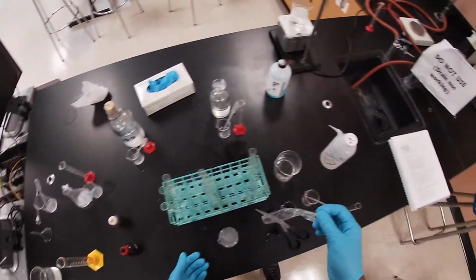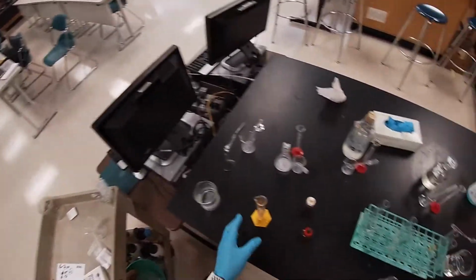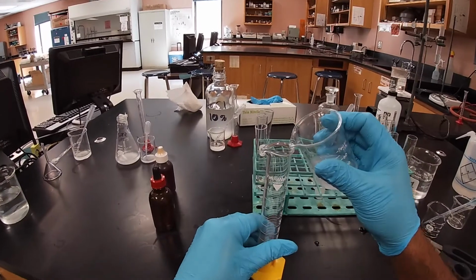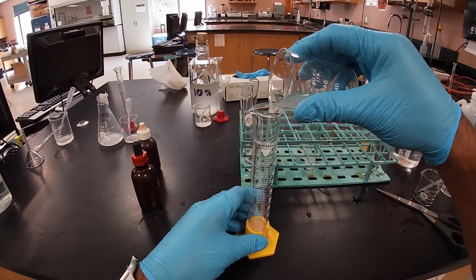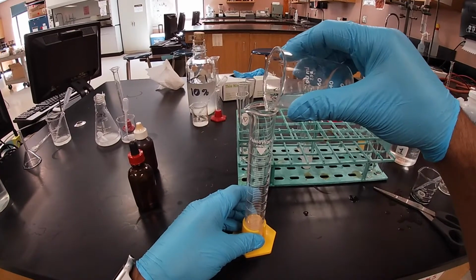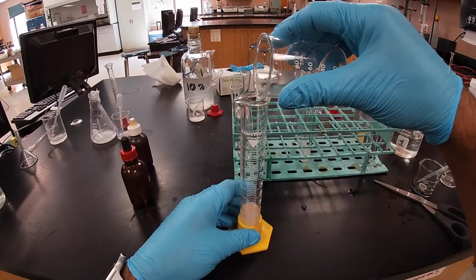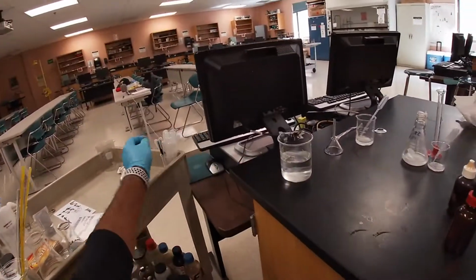So then the next thing that we're going to do is measure out 15 milliliters into our container here. And then the remaining content, let's go ahead and pipette the rest of the way.